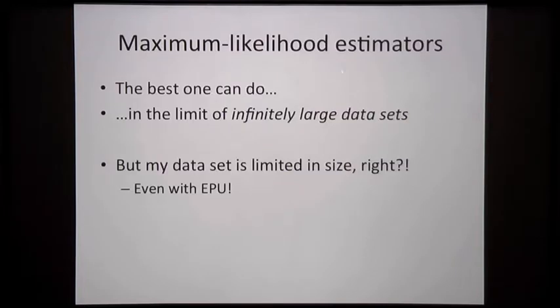Now the good thing about all these maximum likelihood estimators is that under some conditions you could say they're the best one can do, and one of those conditions is in the limit of infinitely large data sets. Okay. Now that's never true. Even if you do automated data collection on the cryo-microscope for 2 weeks in a row, that's still not true, and that kind of hurts.